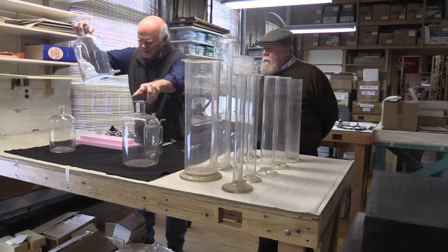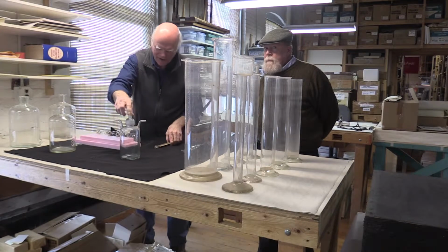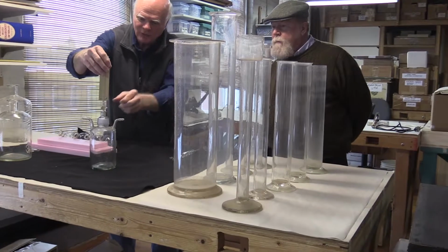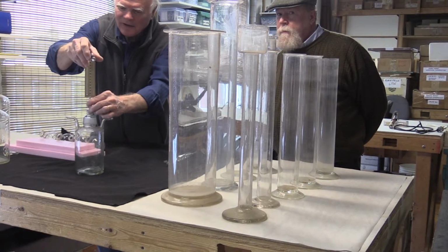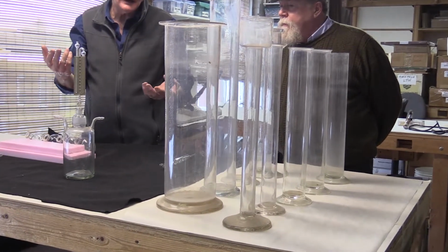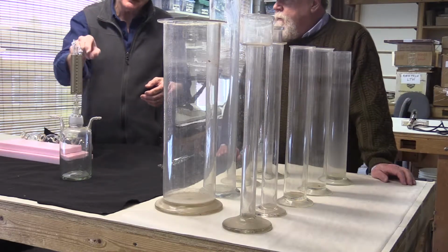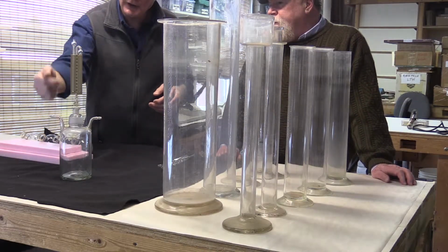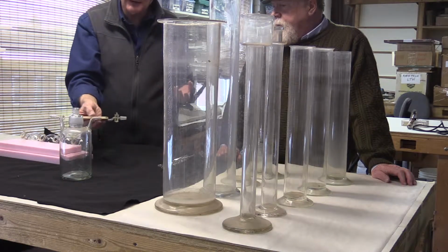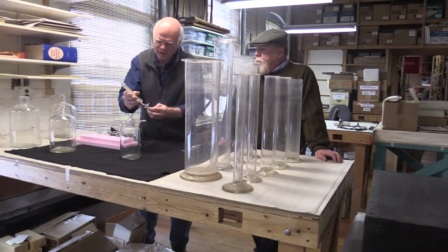And with these sorts of things, this one that you just pointed out here, I'll turn it around so that you can look at it like this. I didn't even know these parts went together until I looked in a catalog. I've got 150 years of catalogs. I would just take catalogs home at night and page through them, and I finally found this apparatus, and it was put together with a manometer on top and this flask below, but I had never seen them together. I ran back to the studio and found the two pieces and put them together, and indeed they do fit.